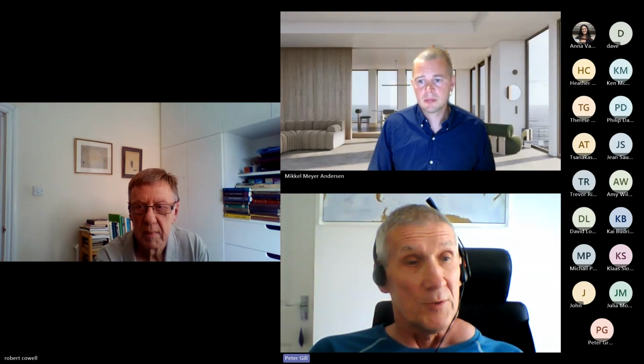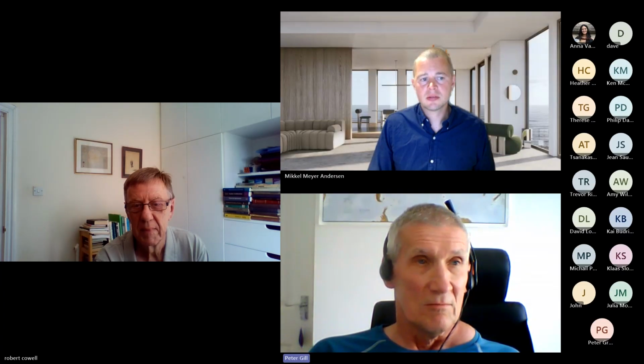And then if you go to 5, 6, or 7 contributors, for example, what happens is that you find that the likelihood ratio will stabilize. And the reason it stabilizes is that if you have too many contributors, the mixture proportion values become minute. And because the mixture proportion values are so small, they have absolutely no effect on the LR. So I always think of the number of contributors as a red herring, really. It's kind of a nuisance parameter, really, but it's not as difficult as people make out.